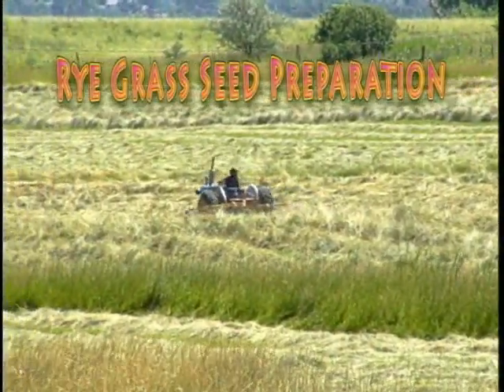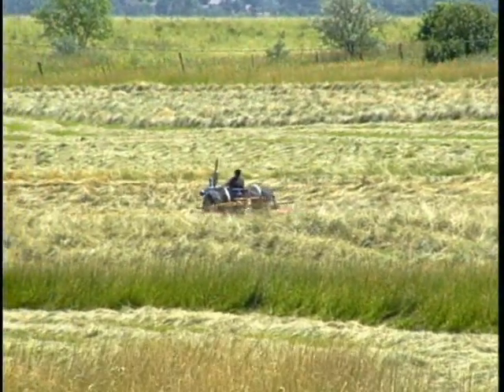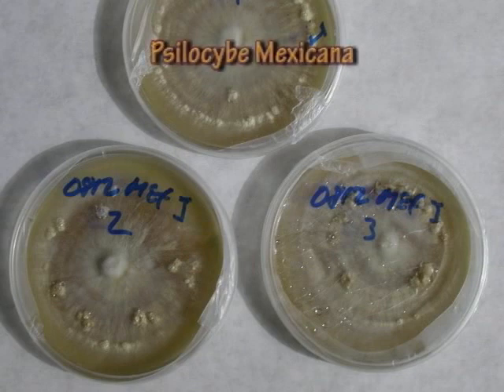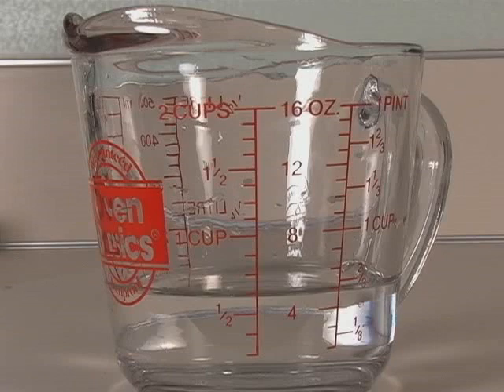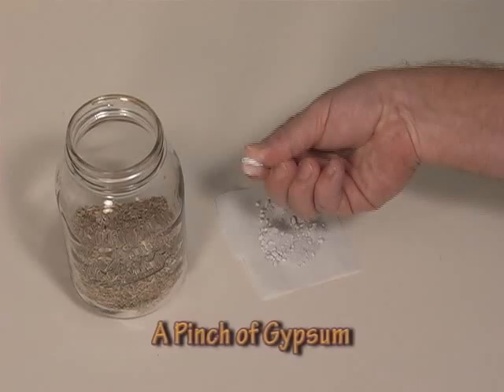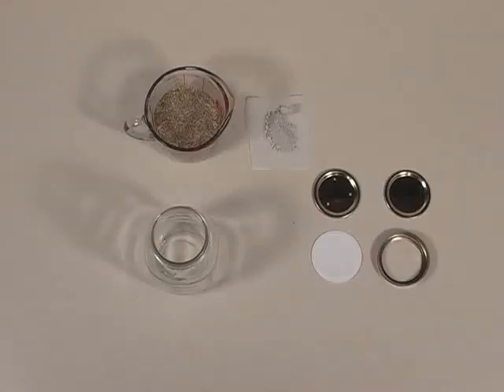I want to briefly cover the preparation of rye grass seed. Rye grass seed is commonly used for sclerotia producing species. The basic recipe calls for one and a quarter cup, or 300 milliliters, of rye grass seed, and one-half that amount by volume of water — so five-eighths of a cup, which is roughly 150 milliliters. Add a pinch of gypsum to help prevent clumping.